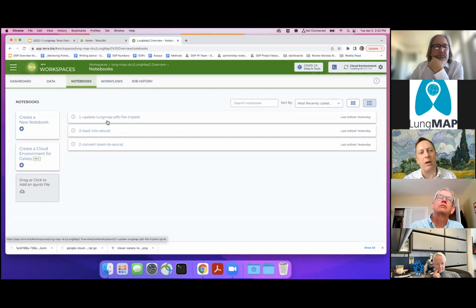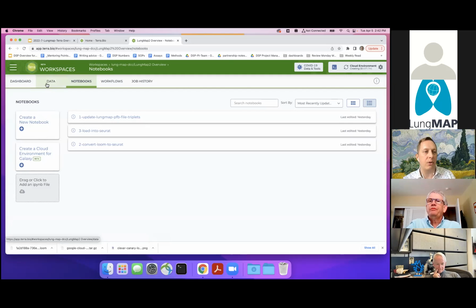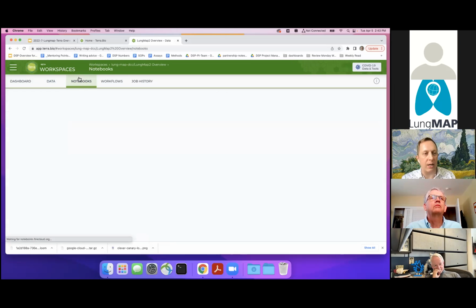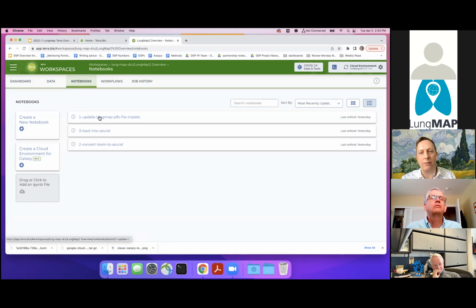Number one is allowing me to update that data table with a new entity. And so if we look back here, this lane file entity that's very, very cleverly named is not in the original thing that David had passed over. Files was, and I want to restructure this. Once again, I could download that, but if you work with programmatic things, or if you wanted to copy this workspace, clone it, and then do your own import, the same metadata schema will be used, and so the same notebook should be useful for it. So it's a way of automating things a little bit.